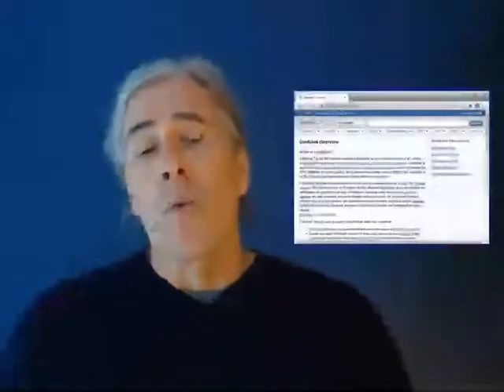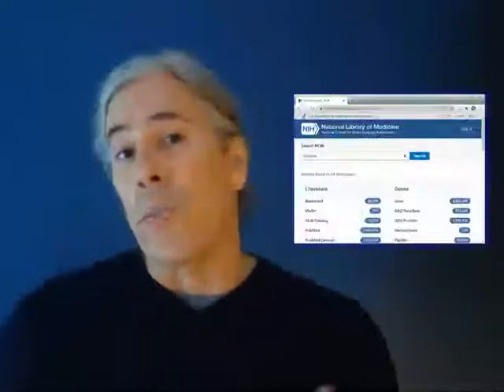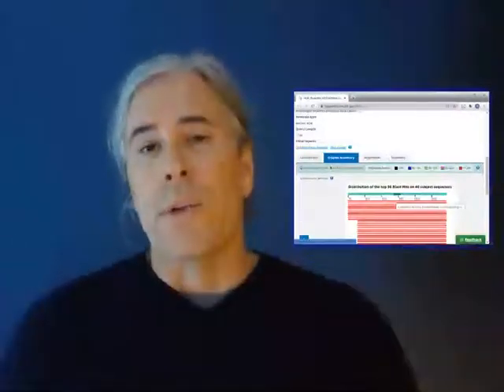So in today's lab, we'll be exploring GenBank, which is the primary repository of nucleotide and protein sequence information. And we can explore and search GenBank in 2 ways. We can use NCBI Search, which allows us to search by a keyword, or we can also use a tool called BLAST, Basic Local Alignment Search Tool, to take our nucleotide or protein sequence and to search against all of the sequences in GenBank. In doing so, we get a list of sequences returned that are similar at the level of their own sequences to our query sequence.